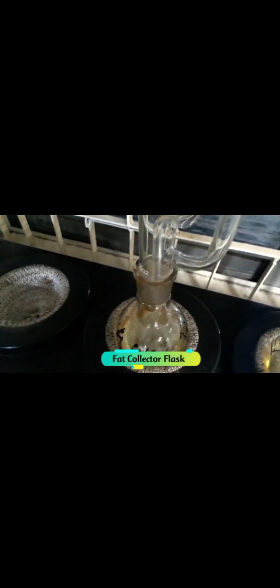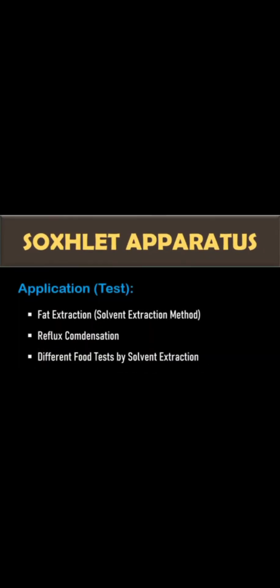A condenser is connected to a cold water source, which aids in turning the vapor into a liquid. A Soxhlet extractor is used mainly in oil extraction, in reflux condensation, and in different food tests that require solvent extraction.